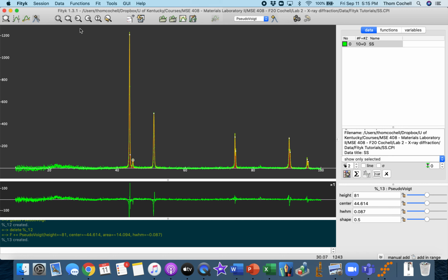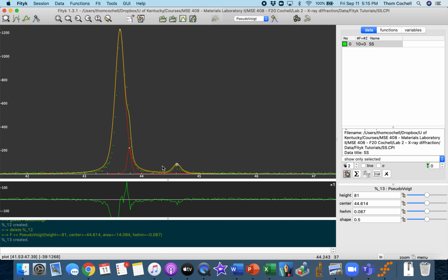So we've kind of given it basic parameters. Again, if I zoom in, I can see that I'm saying there's roughly a peak here, and all through it, that's what it looks like. But what I'm going to do is allow the fitting process to happen. You'll see that there's an option up here that, if I hold over it long enough, says start fitting. What this is going to do is take our basic parameters and try to fit the curve with those peaks that we have, and it's going to try to minimize the difference between the peaks that we've selected and the resulting curves from those.